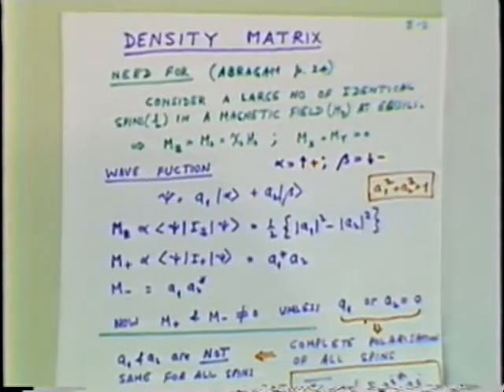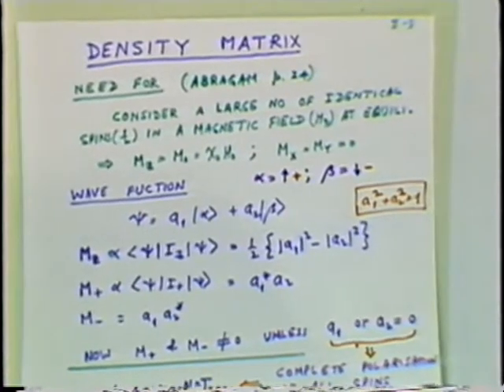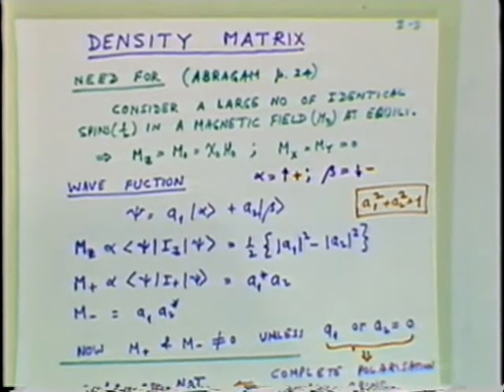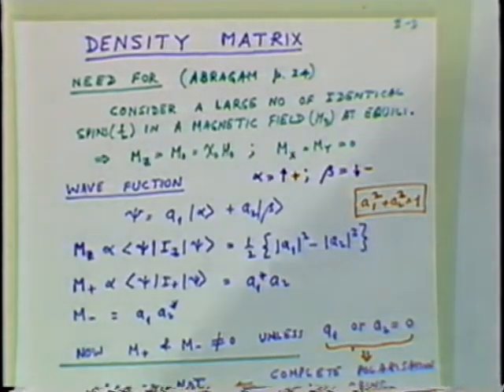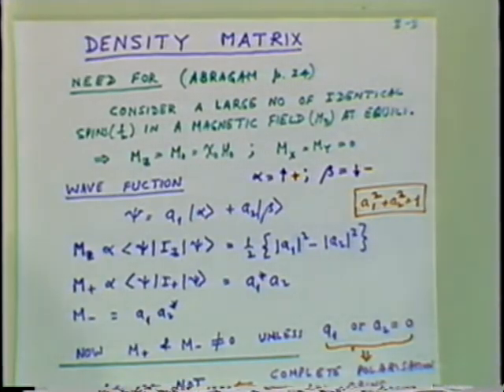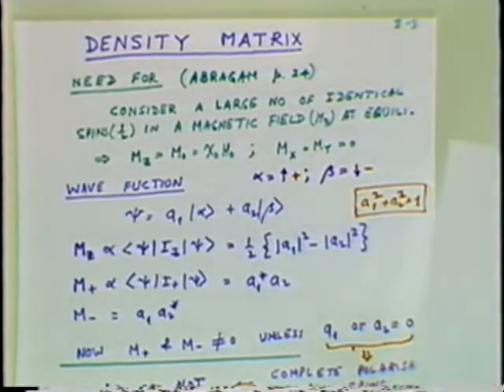We use a concept called the density matrix to describe the time evolution of the magnetization in time domain NMR experiments. And since two-dimensional NMR experiments are time domain NMR experiments, it is very useful to use a density matrix. And for those who are not convinced why one should really use the density matrix, I have a very brief reason for using it.